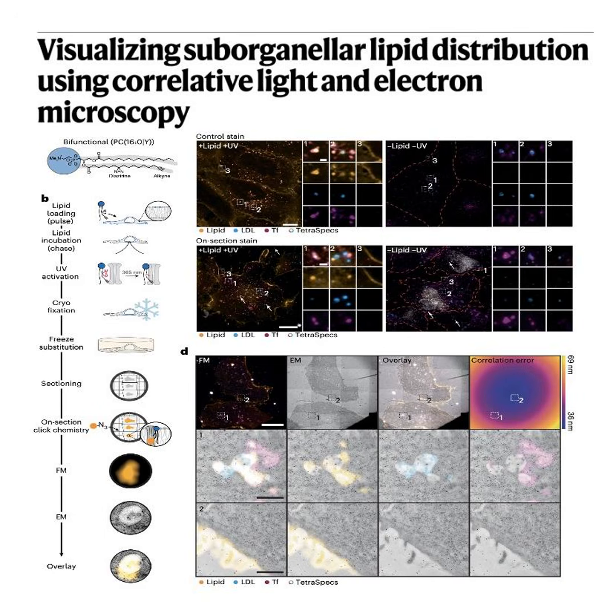But, if I'm playing the skeptic here, cells have incredibly sensitive alarm systems. If you just swap a synthetic molecule into a live cell membrane, normally calcium alarms go off immediately. How do they prove the cell isn't freaking out over these probes? Oh, they ran an exhaustive validation checklist. I mean, a true cellular stress test. First, they looked at metabolism. They use a 4-minute loading pulse to get the probes into the cell. And during that exact window, practically zero probe metabolism occurs. The native lipidome, meaning the cell's existing fat composition, isn't remodeled at all. So the cell doesn't even try to digest it or kick it out.